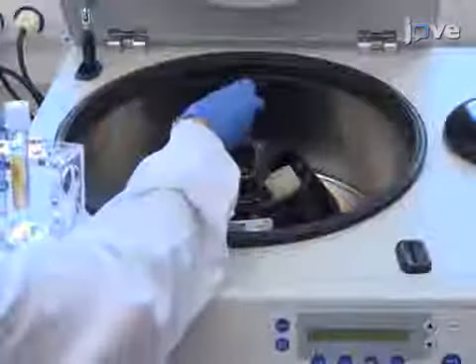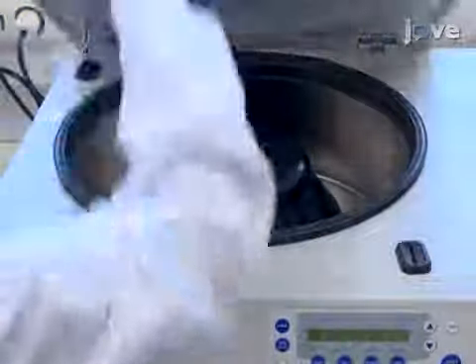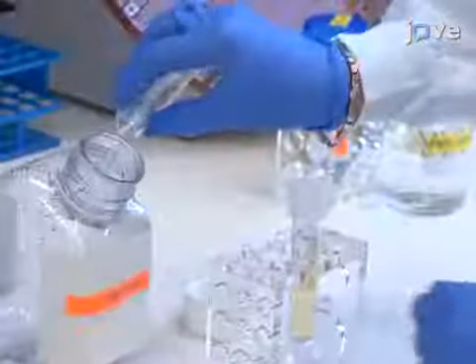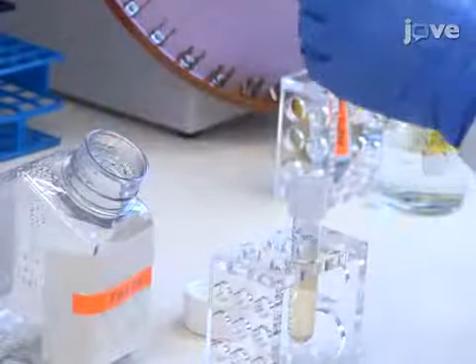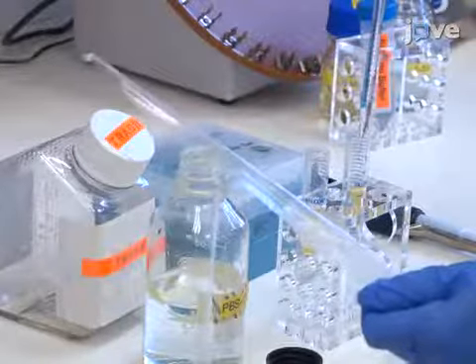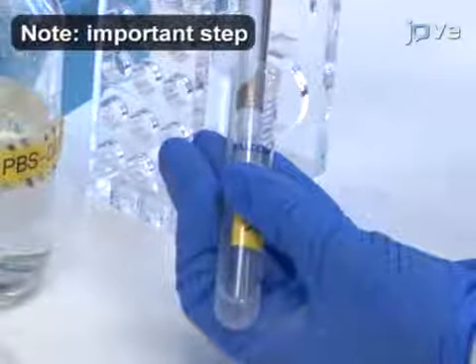Next, pellet the cells by centrifugation for 5 minutes at 4,500 G at 4 degrees Celsius. Remove the supernatant from all tubes. Add 1 milliliter of 1x PBS to each tube, and resuspend the pellet to minimize cell-to-cell aggregation.